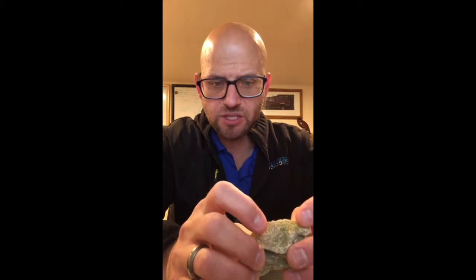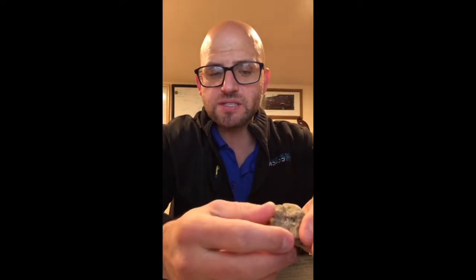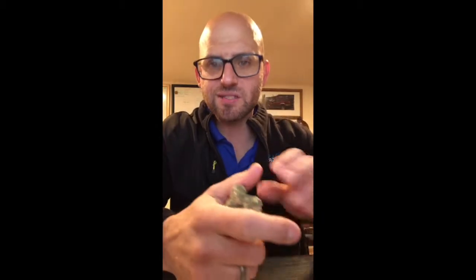Wanted to do a part 2 on this abrasion spiel that we did a few days ago. We covered this scanning electron micrograph image of a sample that had just gone through abrasion testing, and the question was, scanning electron microscopy, transmission, all these nanostructure characterization tools, how do we really use them in the operational world?